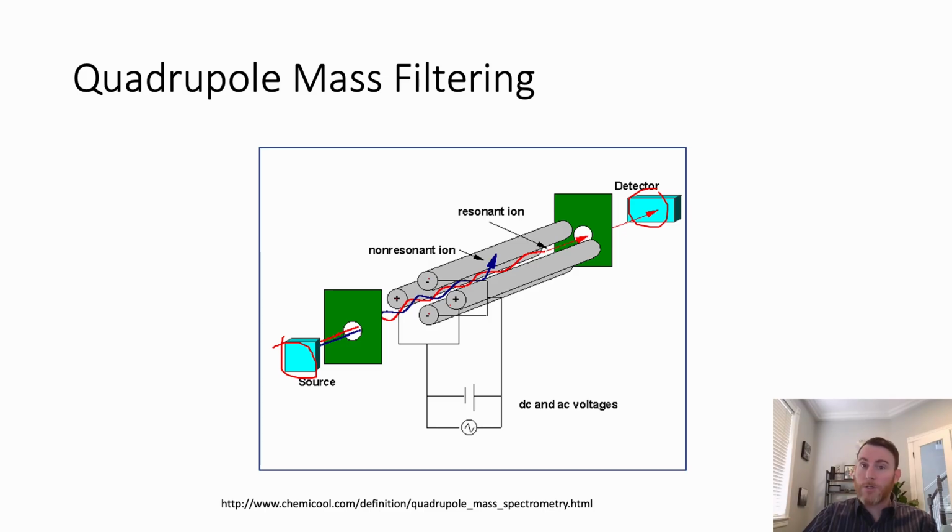And so the 2 negatively charged poles become positive, and the 2 positively charged poles become negative. Now, right before those ions were getting ready to interact with those negatively charged poles, the poles have become positive. They are now repulsed from those poles. However, the 2 poles that were formerly positively charged have flipped to negatively charged, and now those ions are attracted to those newly negatively charged poles.